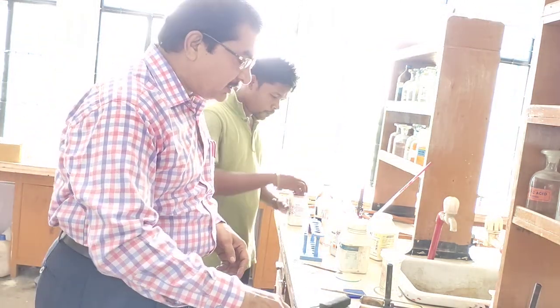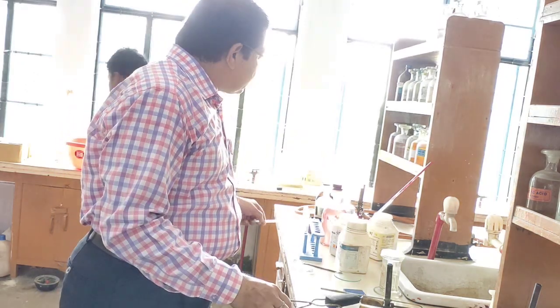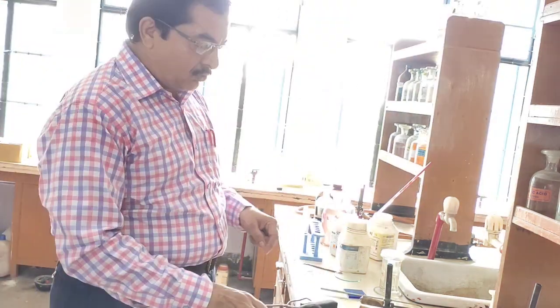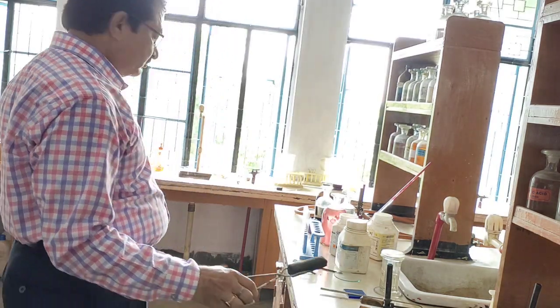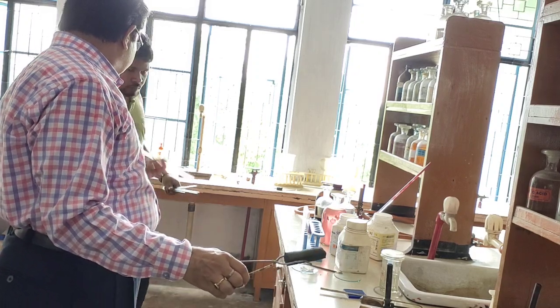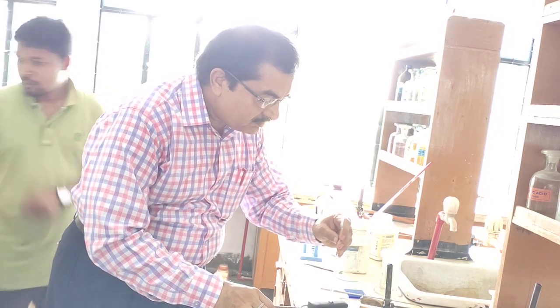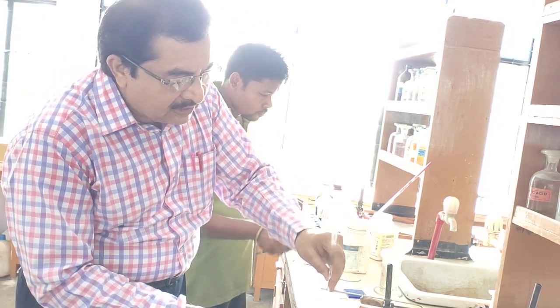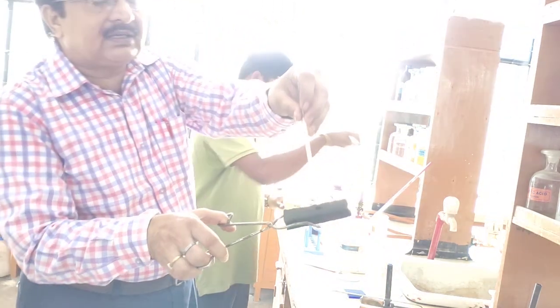With this we are holding it, and with a glass rod we are making a hole, that is called a cavity, in the charcoal. See, we are making one cavity here. This cavity is made. See, a very clear cavity is made here.